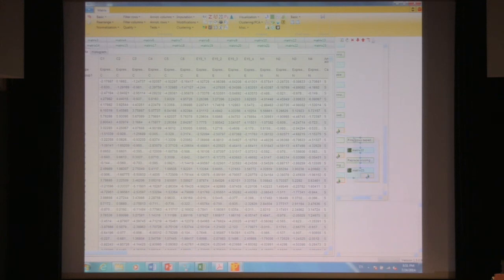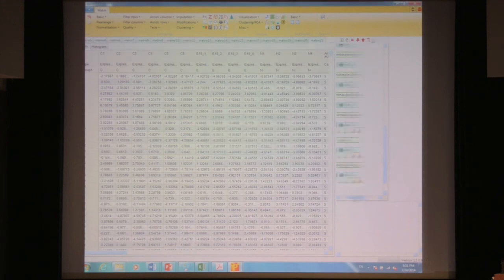Just using the workflow here, in case you haven't seen it, you can select many nodes at once and remove the selected nodes using that button. This can be useful in case your workflow is getting really busy.